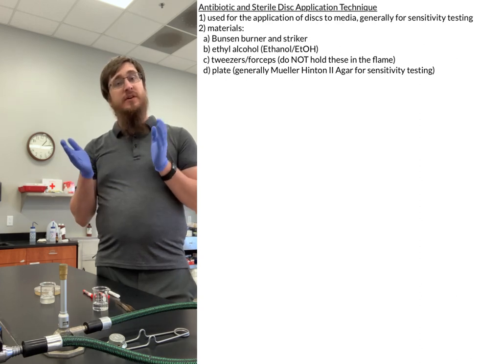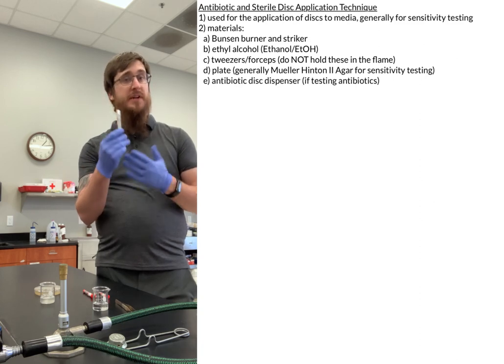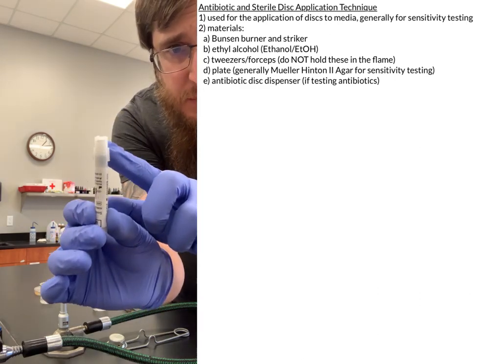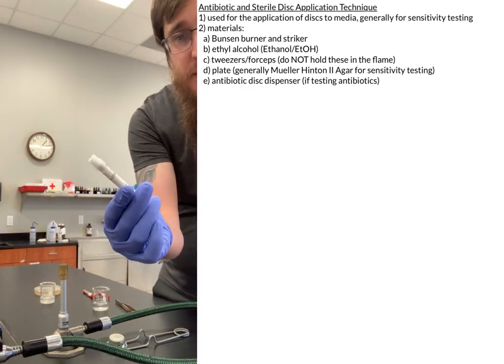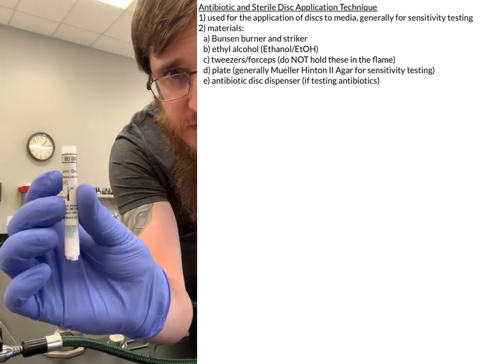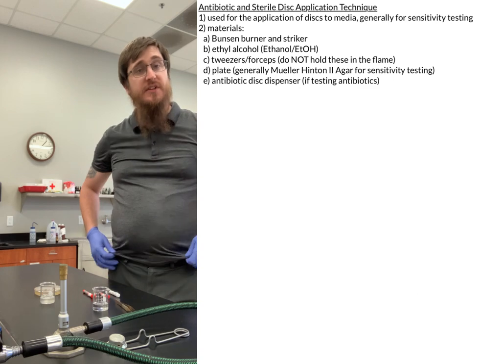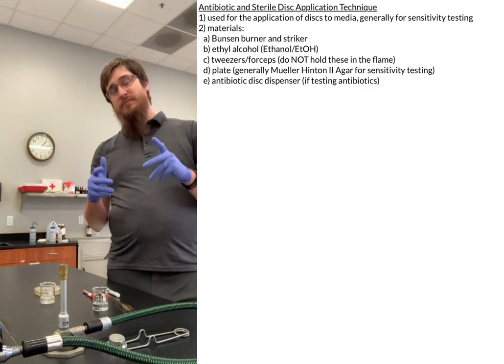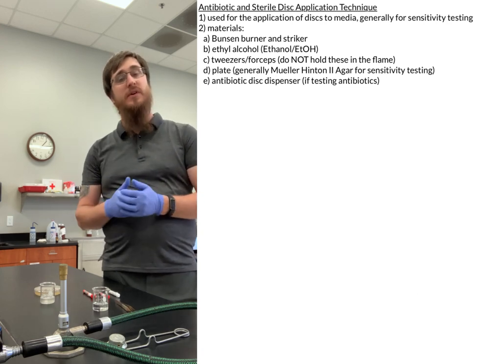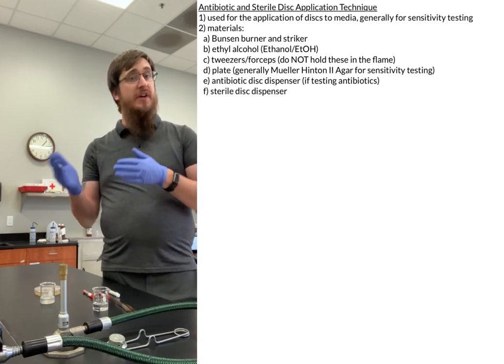Now, if we're doing this on an antibiotic side of things, normally what you're going to need is some kind of dispenser with an antibiotic disc on it. The way that these work is that inside of here, there's a whole bunch of little discs, and these discs have a specific type of antibiotic on it. This one, it says the name on there, happens to be penicillin. Kind of hard to see there, but this just happens to be a penicillin disc that we have here. And again, we're going to be putting that on the plate to see how well it performs against a specific type of microbe.